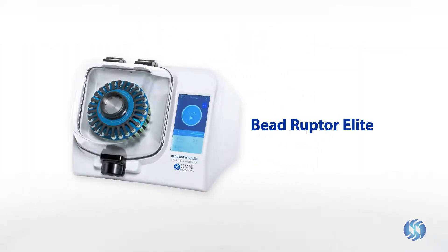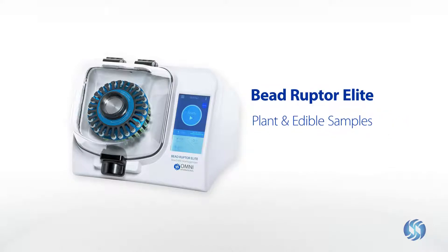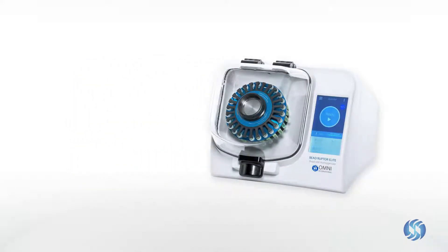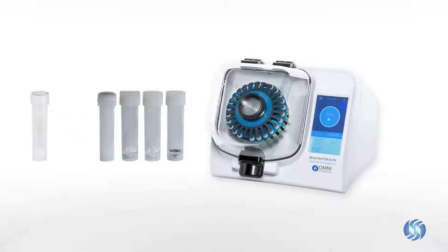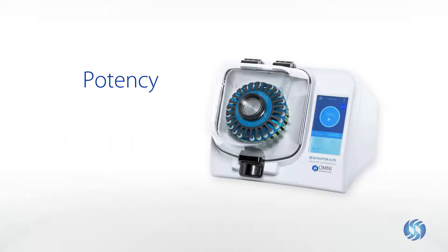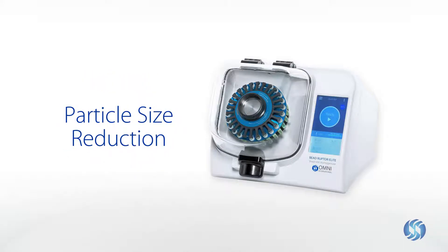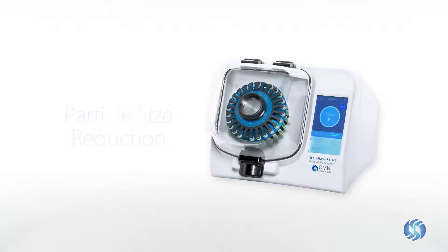Bead milling with the Beadruptor Elite offers a rapid and effective method to dissociate both plant and edible samples for laboratory testing. The Beadruptor Elite is a powerful and scalable bead mill homogenizer that utilizes disposable pre-filled bead tubes to rapidly dissociate cannabis samples for potency, pesticide, and microbial testing, while reducing particle size for efficient liquid handling on automated platforms.